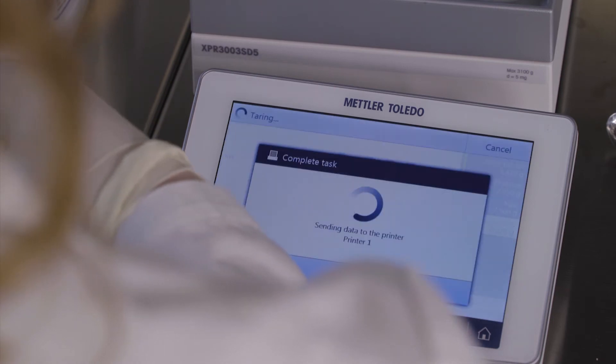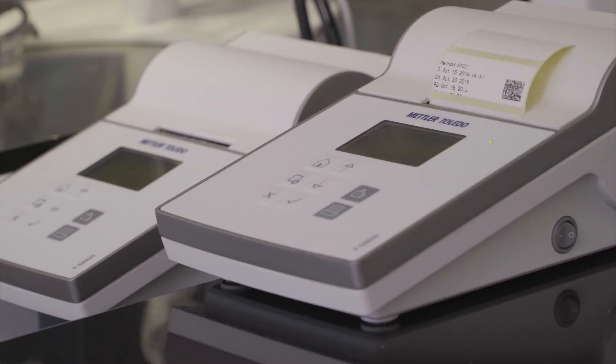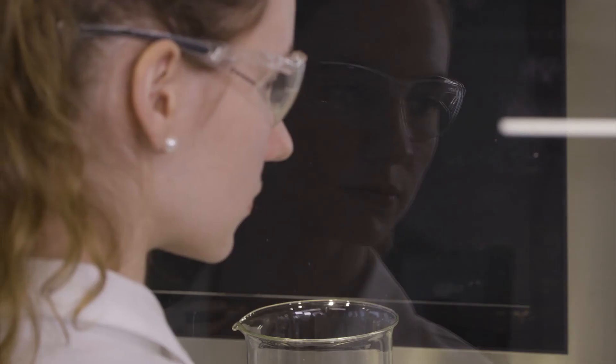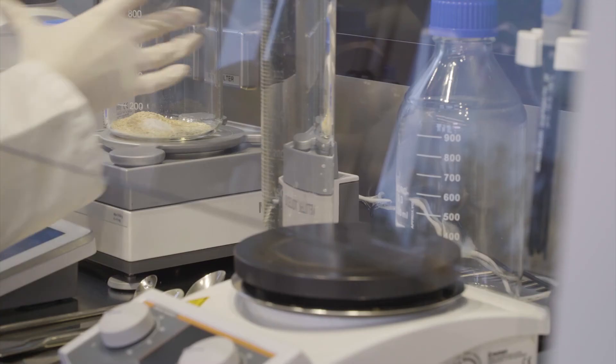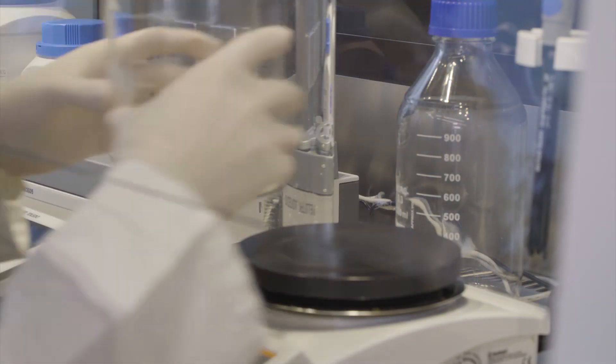Once the formulation is complete, you can print a label directly from the balance. You can also print out the results or export them to a computer.